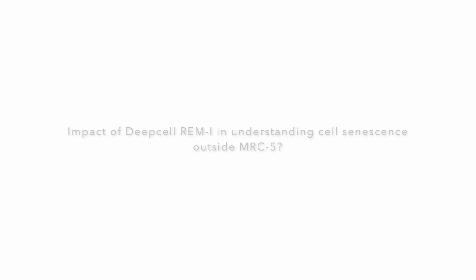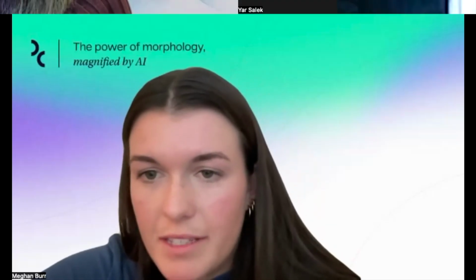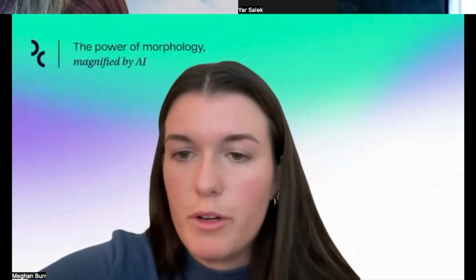Awesome. Thank you so much. I see another question here. I think this one is more for Dr. Heckman's presentation. Someone asked, did you have any previous indication that morphology would be able to identify different profiles between healthy bone marrow samples and AML bone marrow samples before running on the REMI?